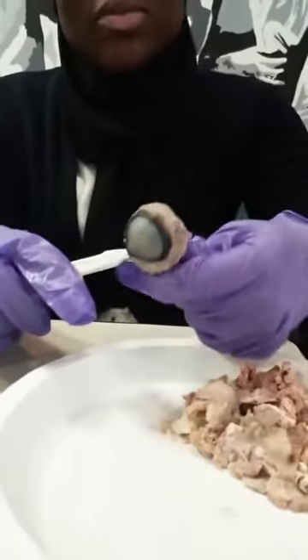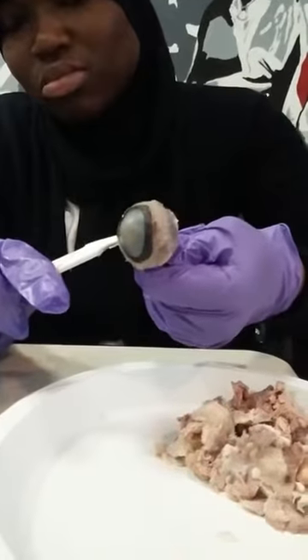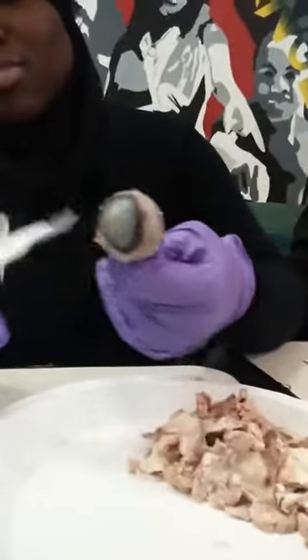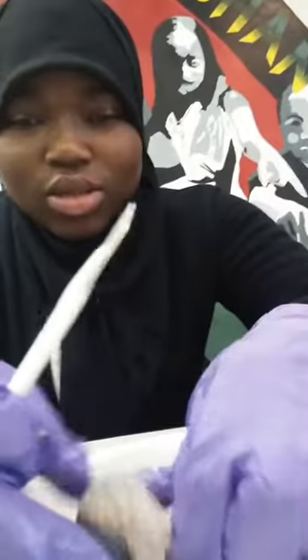If you scrape this all away, this shiny part is called the tapetum lucidum. You ever seen a cat or dog's eyeball shine in the dark? That's what's shining. It reflects light around the inside of their eyeball, so they can see better in the dark.